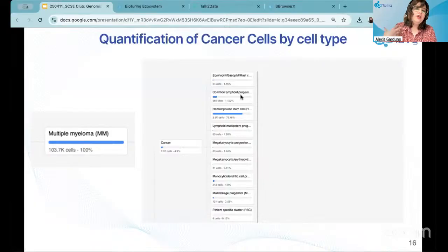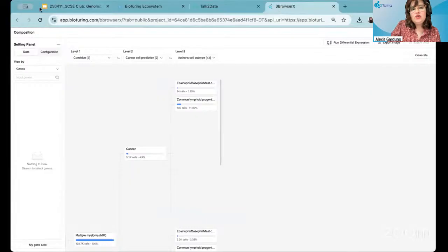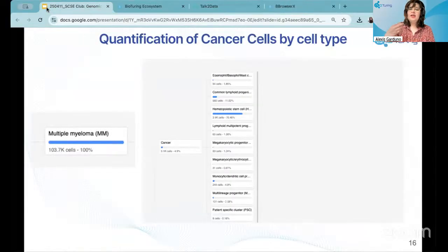And these are other contexts that you can get from the data, to see what annotation differences we can see and what specific cell types are actually transitioning within these different alterations in the sample. So the next question is how can these cancer cells differentiate across different treatments?